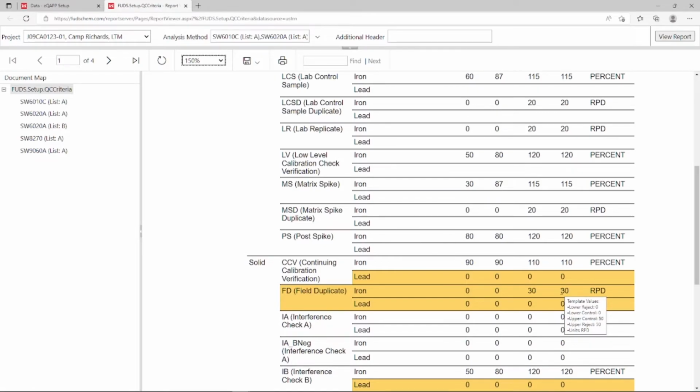Note, the ADR compares these numbers listed here with the exact number that the lab submits. So, if your upper reject limit for the matrix spike is 125%, and the lab reports 125.1%, the system will see the 125.1% as out, and flag it accordingly. If you want the lab to round down, then they will need to round the data in their SED file, not just in their lab report, to avoid being unnecessarily flagged.